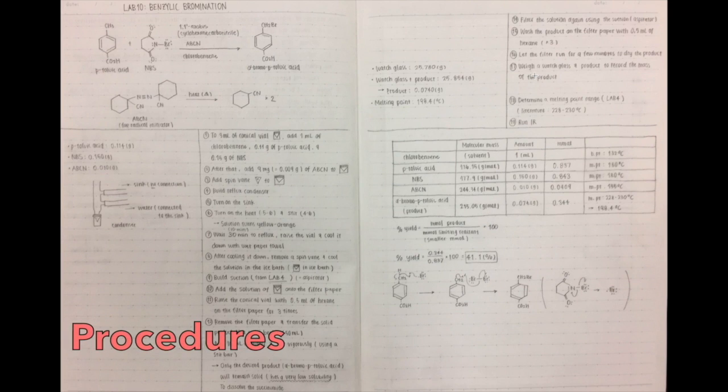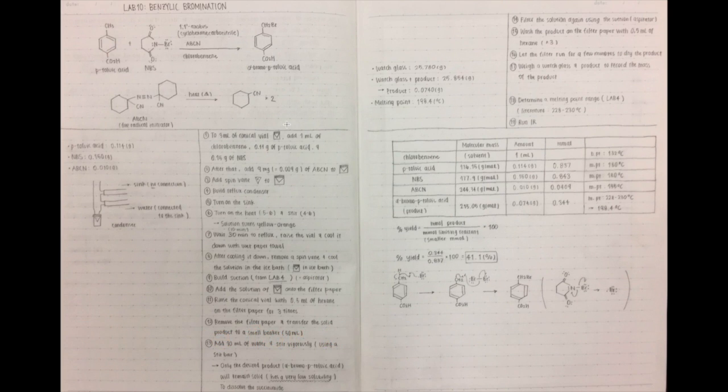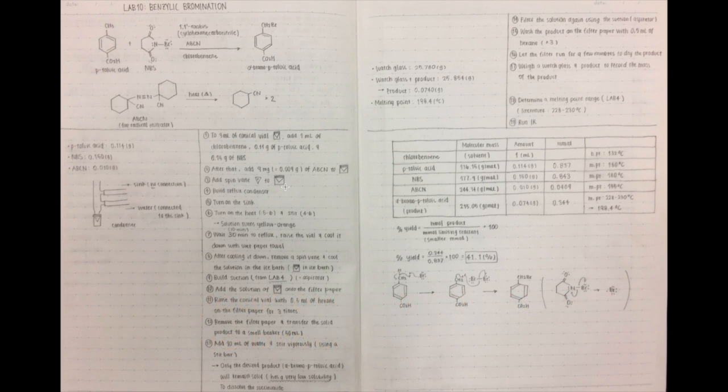The procedures are normally written as you prepare for the lab. As you do so, your understanding of what you do will increase and you are less likely to make a mistake or get confused in the lab. There are 3 important things you should know as you write down the procedures. First, you should not copy the whole lab instruction to your lab notebook. Sometimes, lab instructions use difficult words or phrases that are hard to understand quickly, so you should use your own words to write out the procedure to understand clearly.